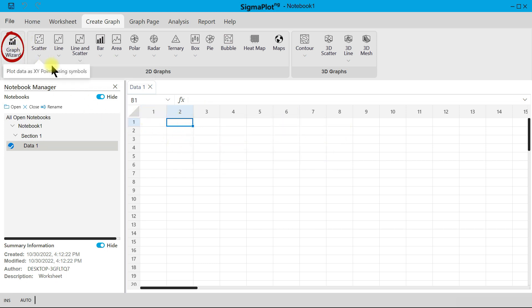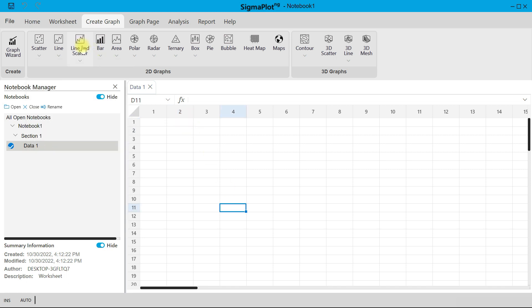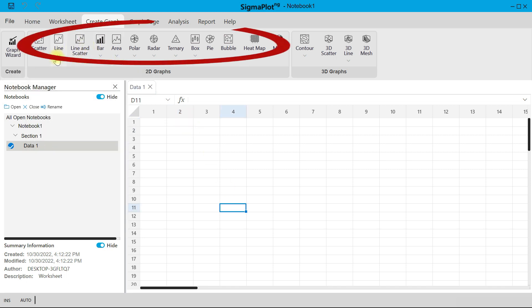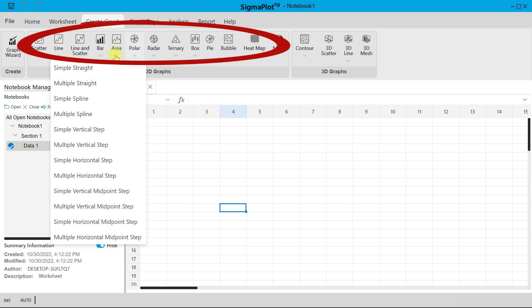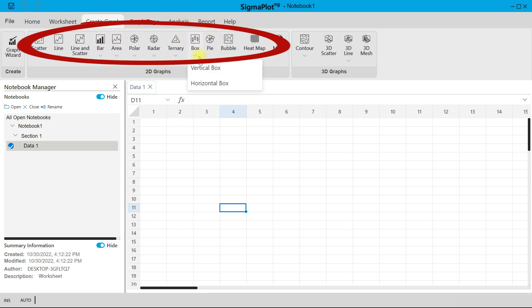SigmaPlot NG already has templates for graphs, which is super helpful. For simple scatter, if you have multiple X and Y's, if you have multiple with error data, among others, you can do that here. You can also come to your Line - you have Line and Scatter, you have Bar, you have Area, Polar. All these are for 2D graphs where you have all of these graphs already inbuilt. Varied templates are provided to you.